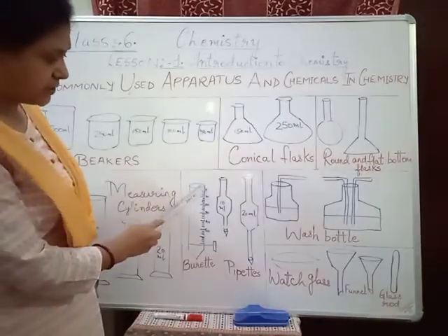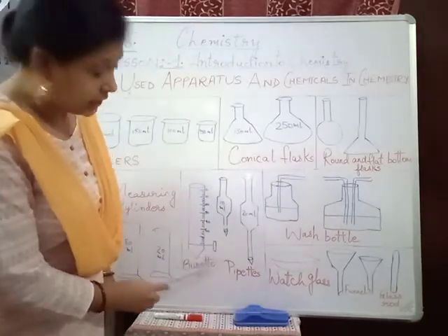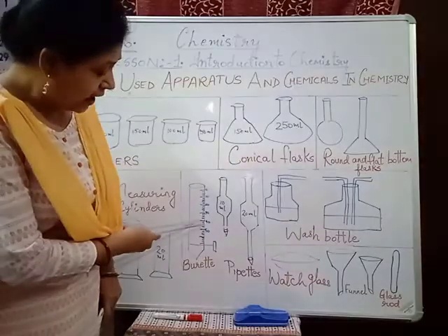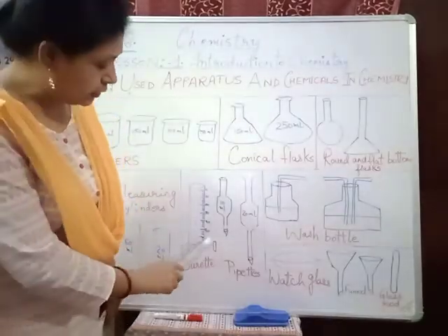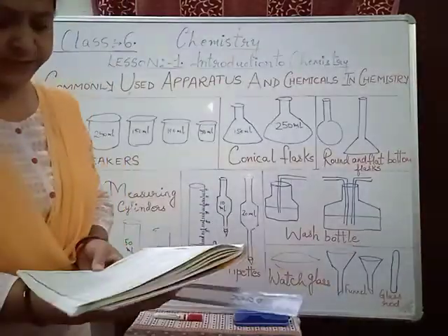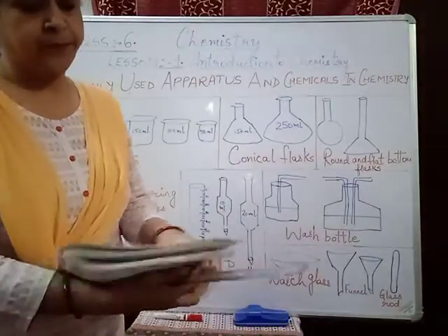It is measured from 0 to 50 and it has a stopcock. The stopcock opens and you can take the liquid, and you can take the measurement of how much liquid you require and you can close the stopcock. So this is for the chemical experiment in the laboratory.